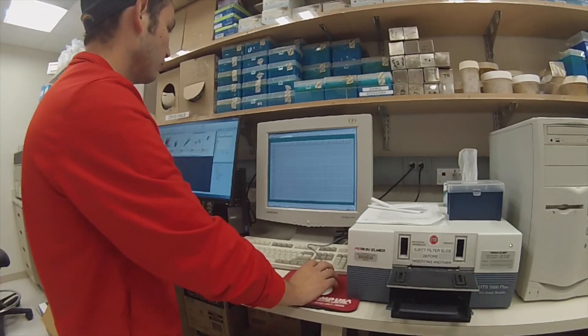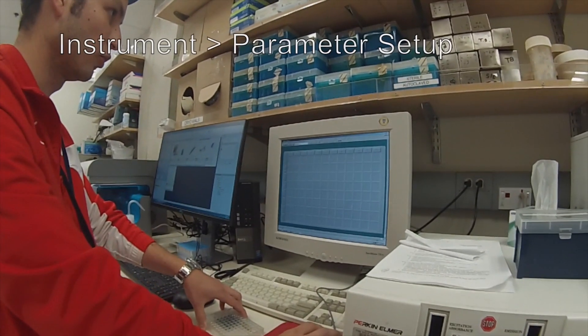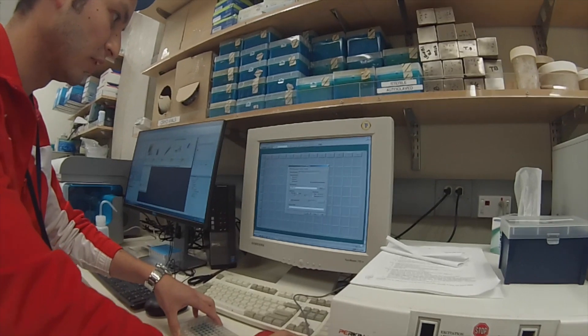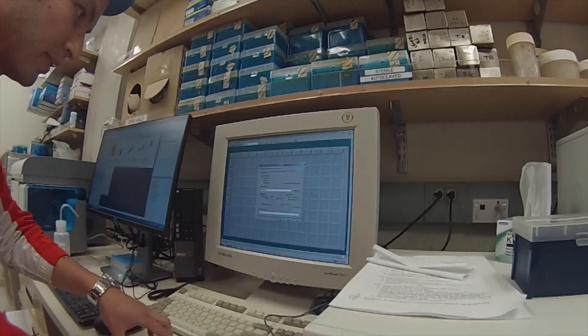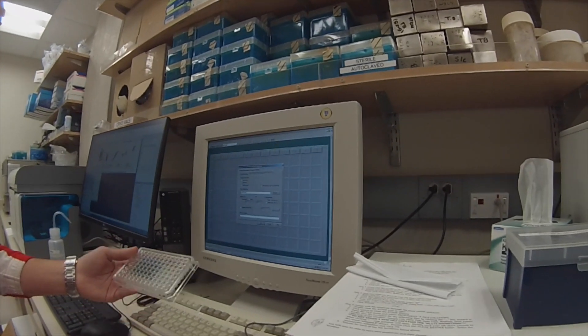The first thing that we're going to do is go to the software called HTSOFT. I'm going to go to Instrument, then Parameter Setup. We're using absorbance in this case. We don't want to read the whole plate because it will take forever.